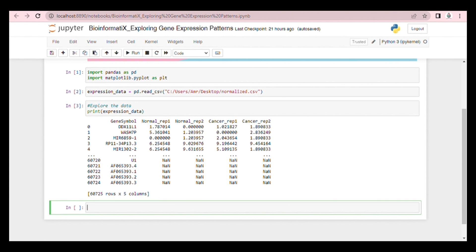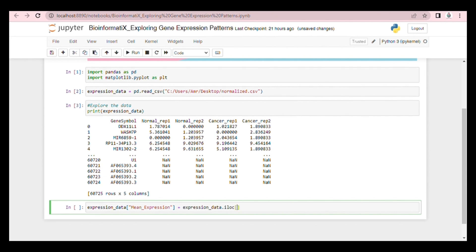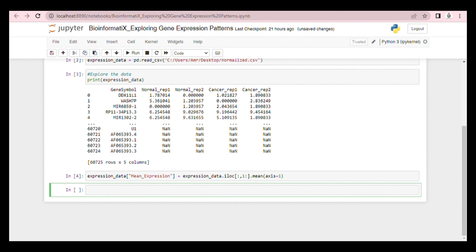Now let's calculate the mean expression for each gene across samples. Then we sort the genes based on the mean expression in the same order.